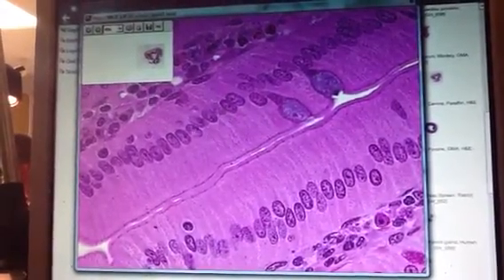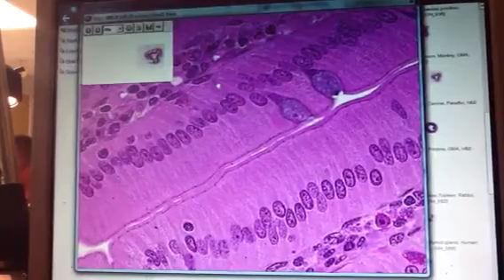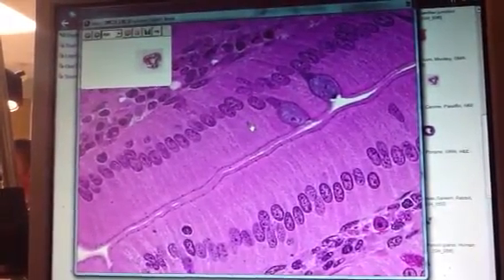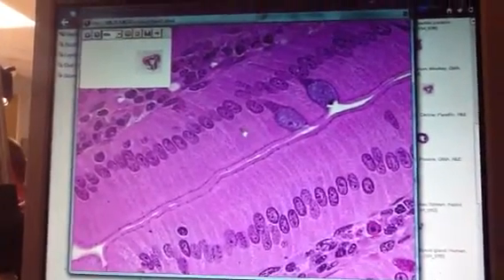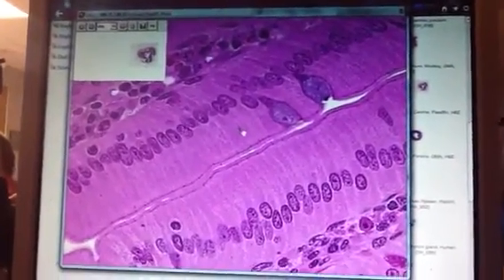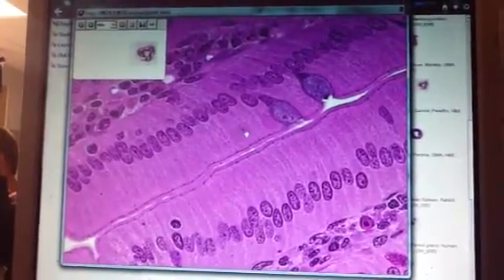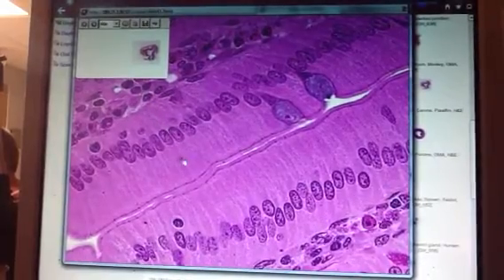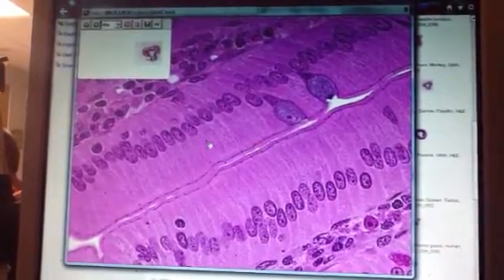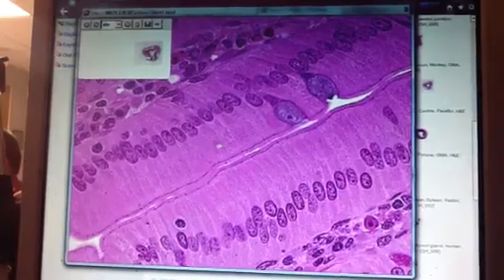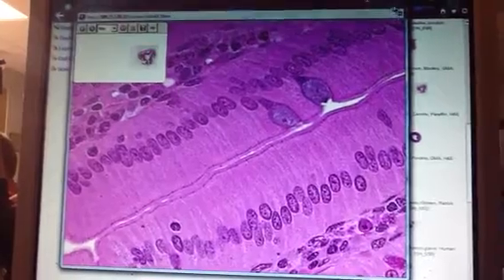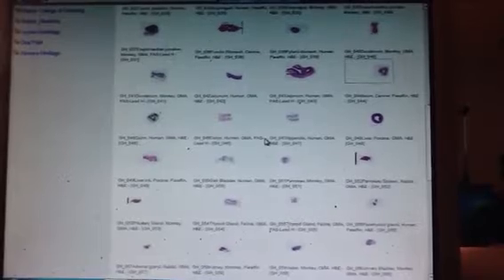Identify this tissue. Hopefully you said simple columnar epithelium. Simple columnar epithelium — one layer of cells, much taller than they are wide. There are multiple places you can see goblet cells as you go along, so I'm not going to pull up multiple slides. Goblet cells should be pretty straightforward on a practical.